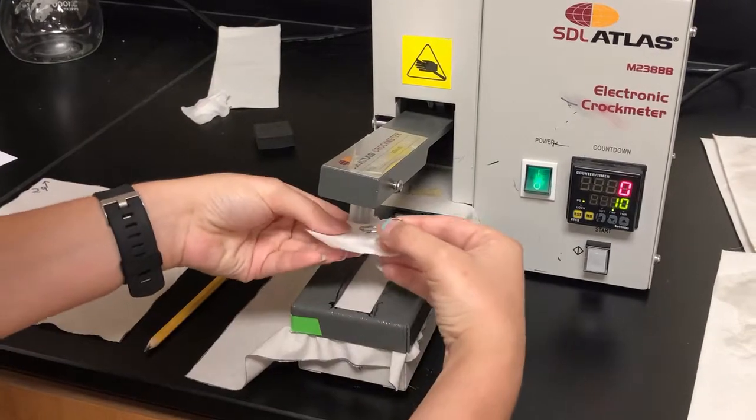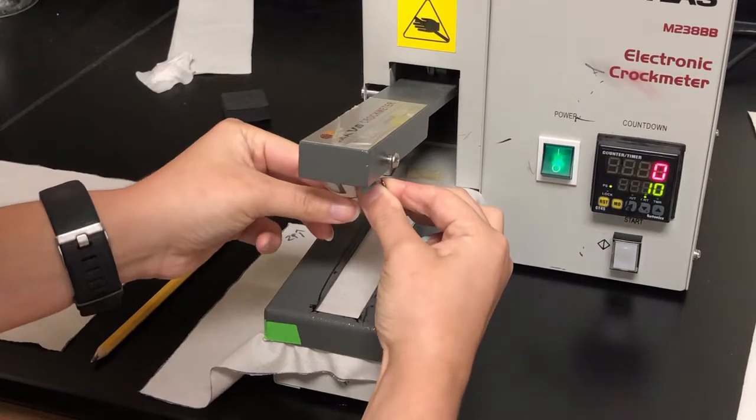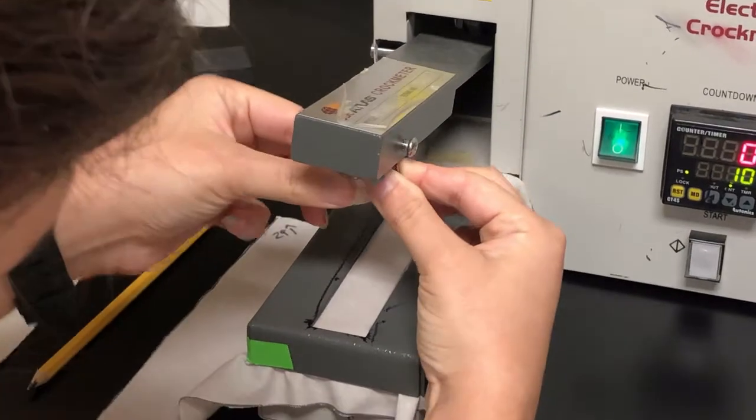Step 3. Mount a dry crock cloth around the plastic finger of the crock meter with the use of a wire clip to keep it in place.